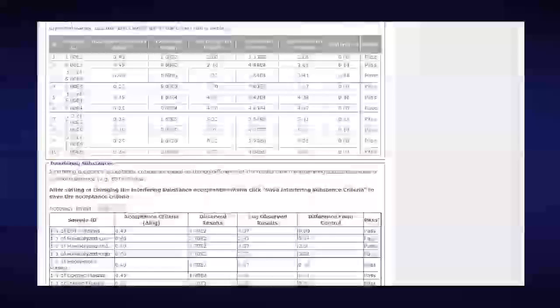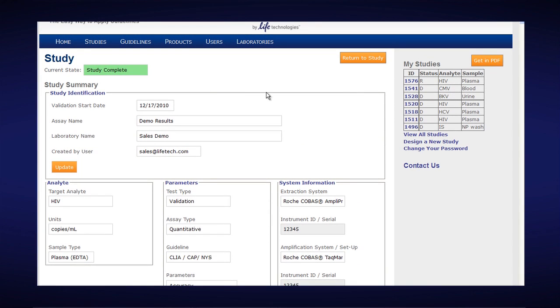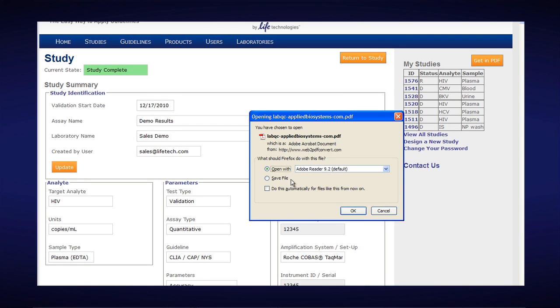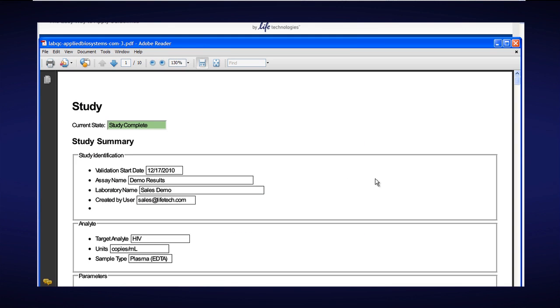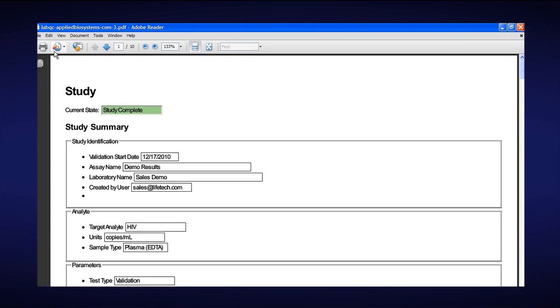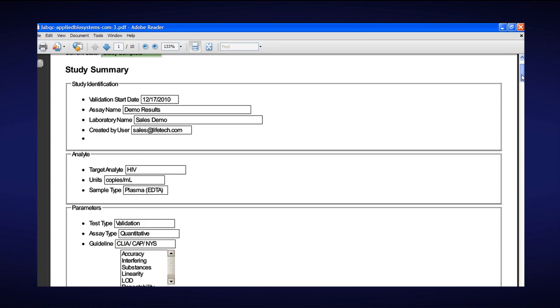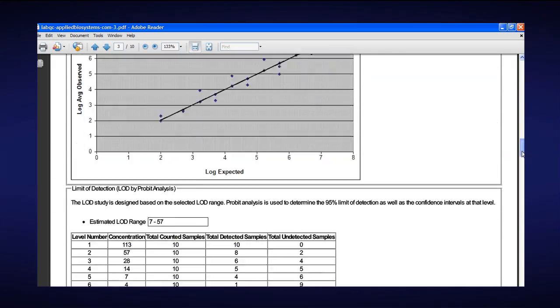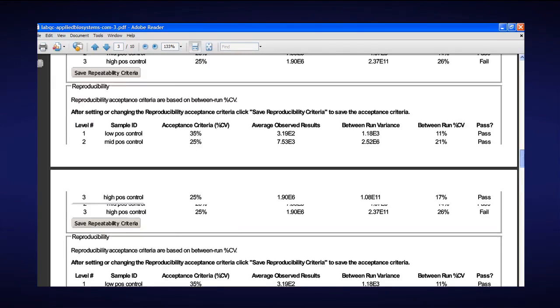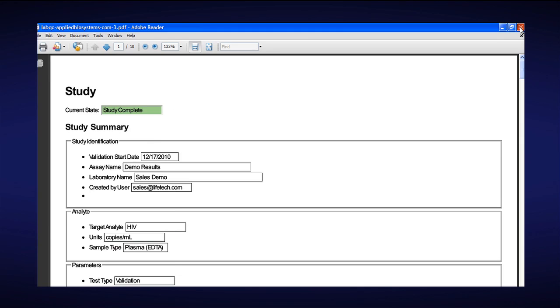This is all available for documentation purposes — that's the online version of the validation report. To save or get a printout, click on Get PDF. The Easy Validation Tool will automatically open a PDF for you. You have two choices: open with, or save directly to your computer. For demonstration, I'm opening it with a PDF viewer, and I can easily print by clicking the print button. It's all the same information, just in PDF format, for all the data of your Easy Validation Tool study.